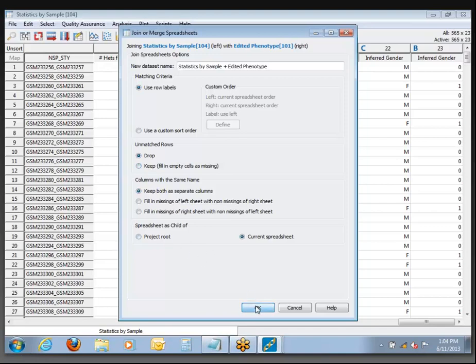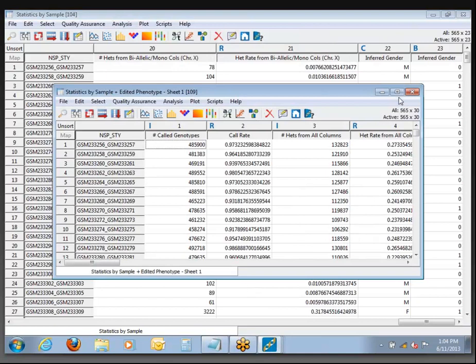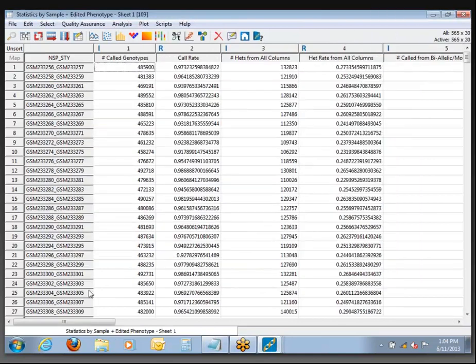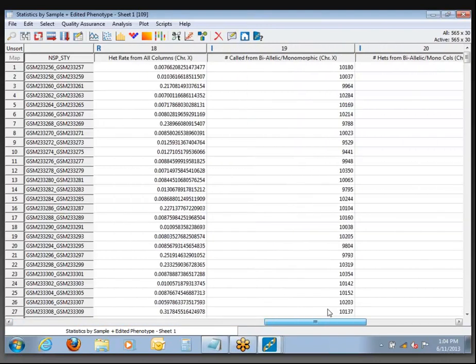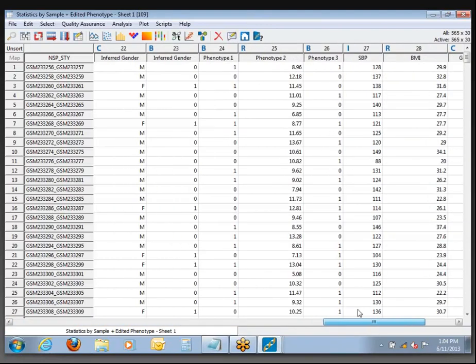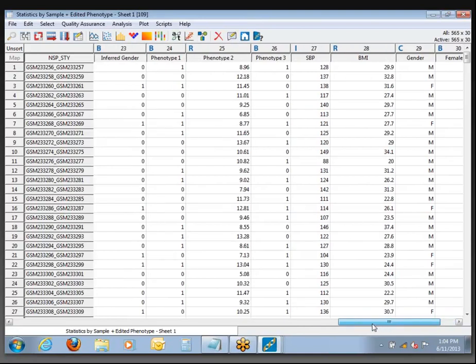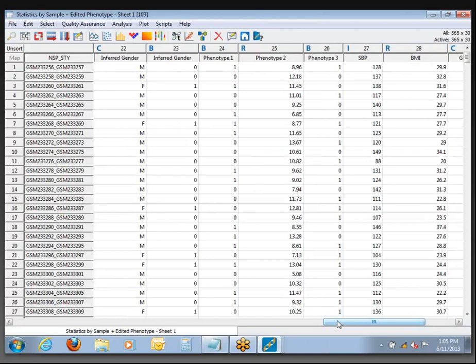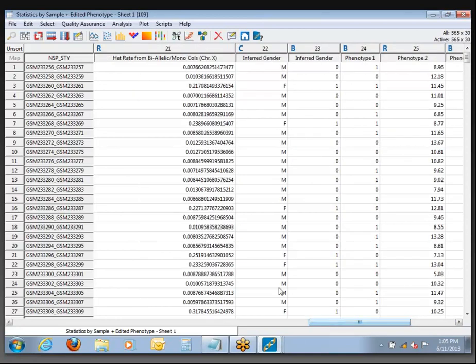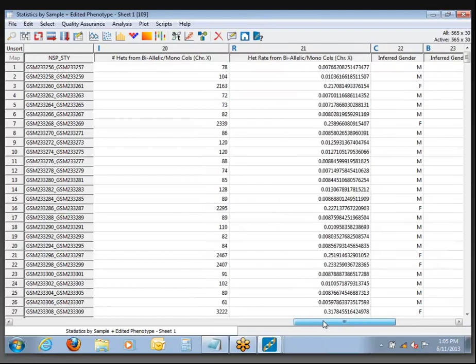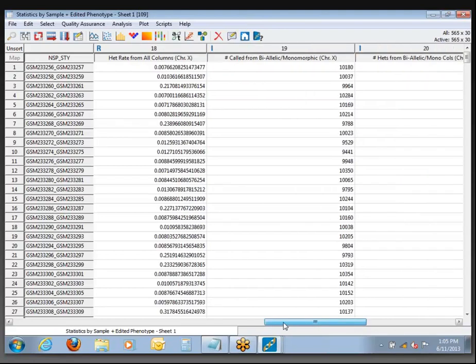Just go ahead and run this with the default options. What we have now is a spreadsheet where on the left we have all of that sample statistics output, and over to the right we have the data from the phenotype spreadsheet. If I want to confirm the gender calls, probably the easiest way is to start with column 18, which is the heterozygosity rate from all columns in chromosome X.